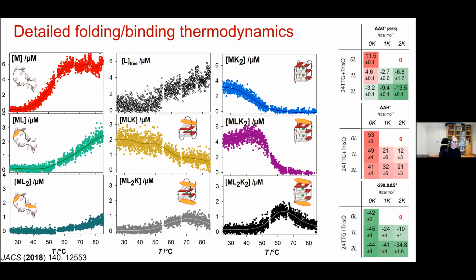So, coming back to the tris-Q observations, and actually it's an observation that we made for many ligands. What we found is that for the ligand binding, we start with this state, which we set as a reference: the quadruplex folded with 2 potassium but with no ligands. And then we compare to this state, which is favorable to bind 1 ligand and 2 ligands. This is delta G. But what is favorable in that is that the ligand binding is entropically favored, not enthalpically favored. And that is something we found for many of the ligands that we investigated in that study in 2018.